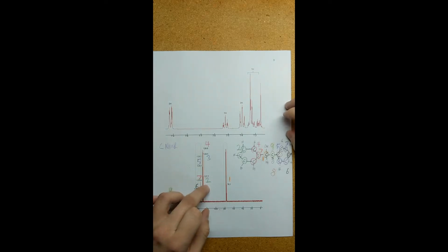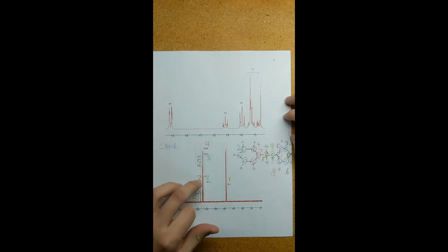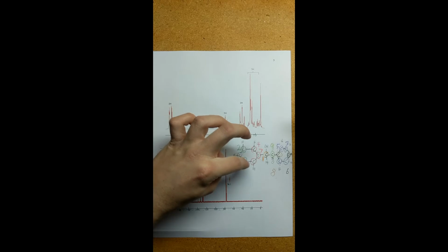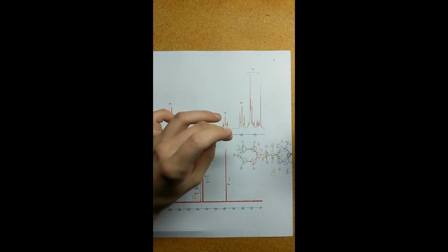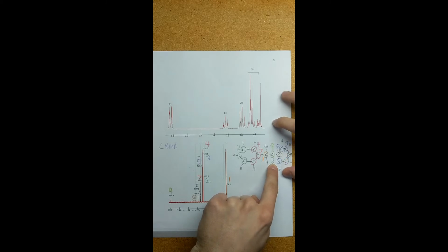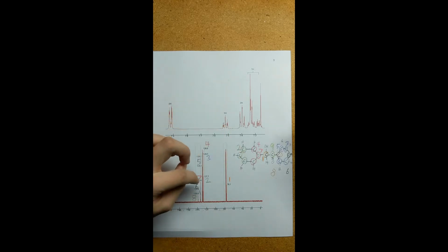Moving on to number 2, our dark green here. I chose these 3 carbons to fit into this group at 127.7 due to involving the ring structures. They are the least deshielded carbons because they are the farthest away from any oxygen. Again, they are extremely far away from the double bonded oxygen, which doesn't leave, and far away from the alcohol group, which does come in and out. So that's why I chose for them to be there.